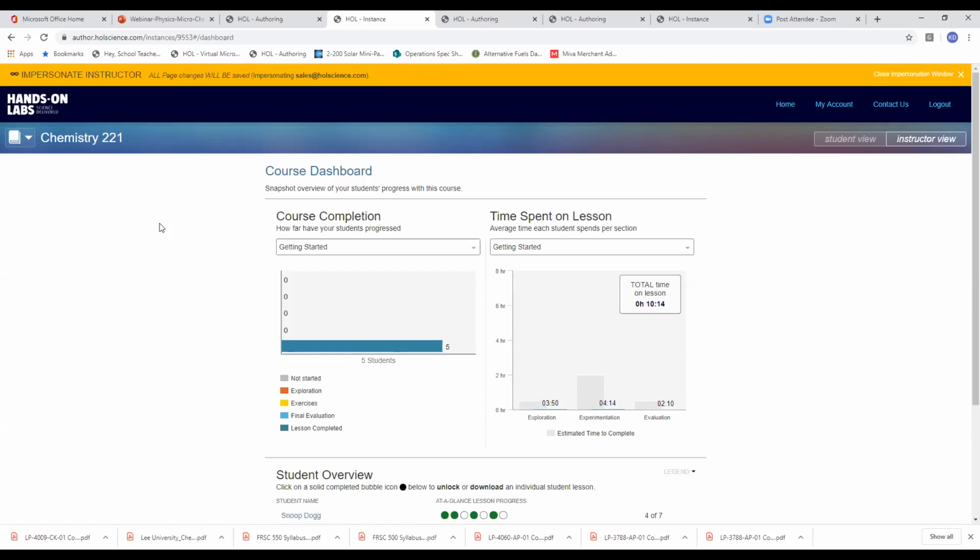So in the lab safety prerequisite lesson, we clearly explain to students, and this is not unique just to chemistry, that it is imperative that they check the local rules and regulations for disposing of any materials, not just chemicals, but things like dissection specimens, if we're talking about some of our other disciplines. We can give you what we would think are best practices to dispose of something, or what works for our physical location. But again, I cannot tell your students something that's going to violate their local law.